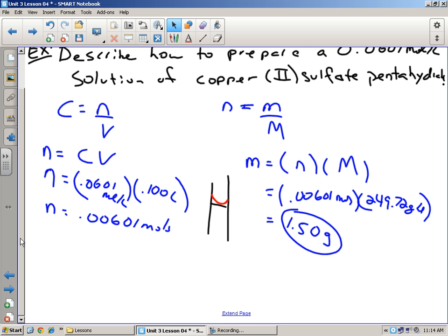If you look from the top, you see two lines. If you look from the bottom, you'll see two lines. If you look at it completely level, you'll see one line straight across. That's where you want to look. You want to fill it up so you see one line straight across and that bubble is sitting on top of it. That's when you have it at eye level, perfectly level. You're going to cap it up again here one more time. Just shake it up a little bit more again, and then you can let it sit. It's probably good, but that's how you make that standard solution.